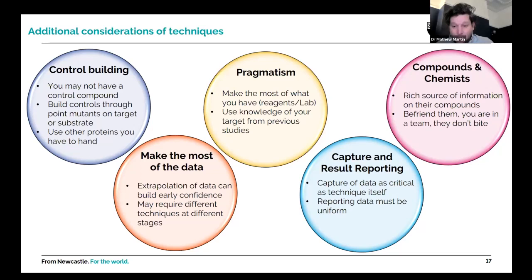With regards to assay output, I really cannot stress how important capturing your data is. I don't mean this in the form of an Excel spreadsheet, although obviously that helps at times. I mean in some form of LIMS system where you can access your SAR data, and you'll find this so important when it comes to the hundreds of compounds that your project does actually bring. And obviously, please report uniformly.